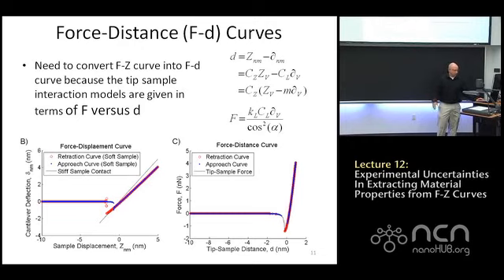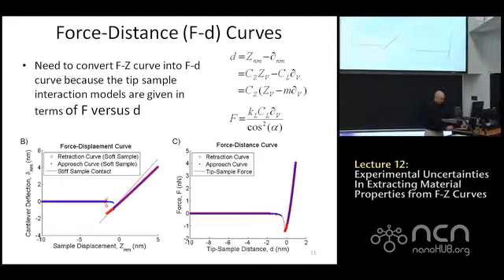No? Then we also have F, which we can write in terms of our observables and calibration parameters, is KLCL delta V over cosine squared alpha. And just graphically demonstrating this, this is our FZ curve in deflection in nanometers per sample displacement in nanometers.